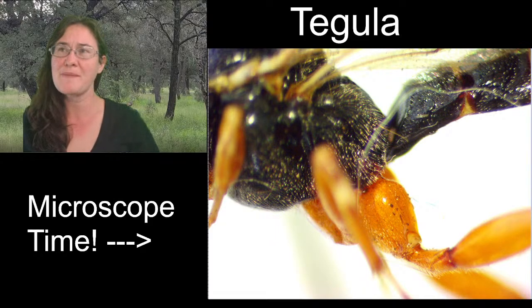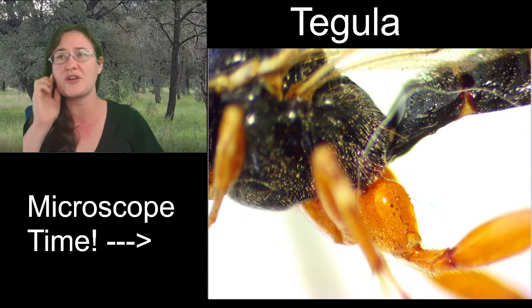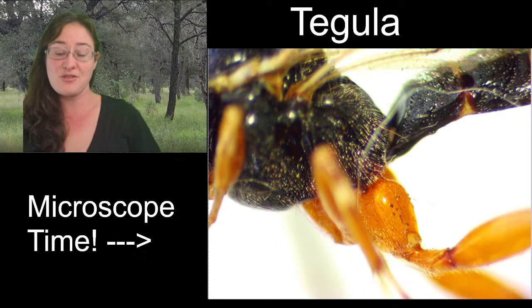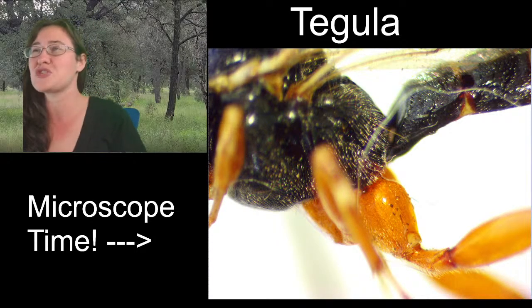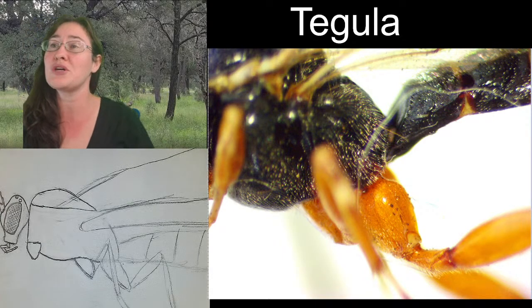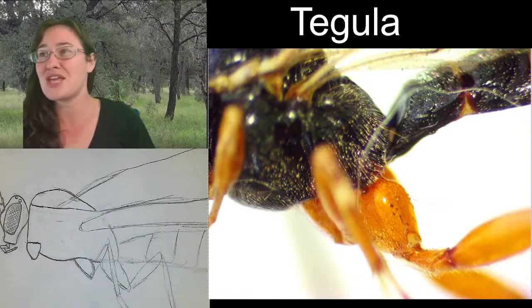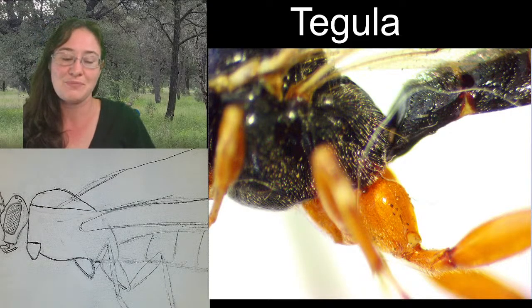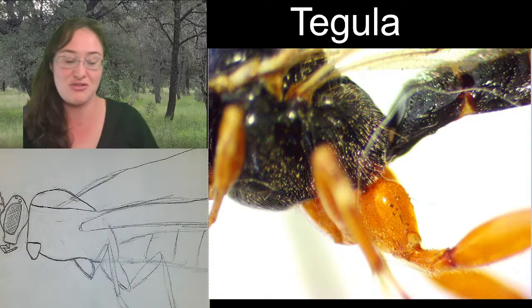Because those segments are generally hidden by the wings. And so we don't even talk about them regularly, which is why they sound like weird names to me. But they are the true words for those regions. It's just that we don't see them, and they don't generally have defining characteristics that use them.